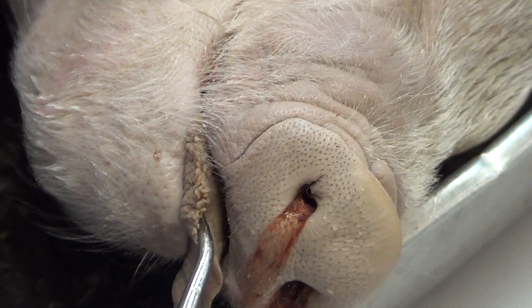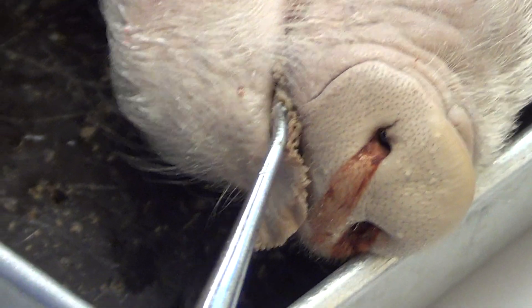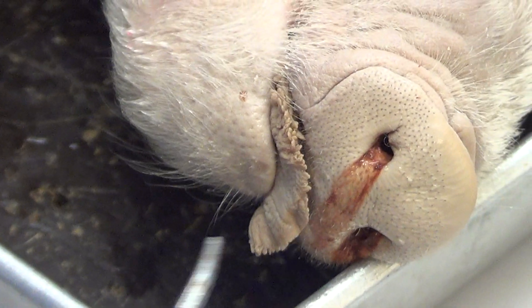And then the tongue, finally. You will notice that the tongue is a little bit different than ours in that it has structures called papillae on the outside, which helps pigs manipulate their environments.